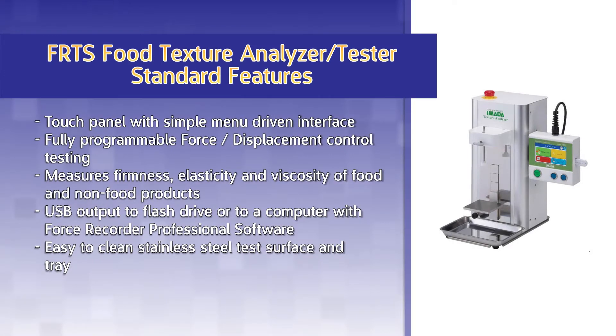The FRTS features a touch panel with a simple menu-driven interface. The tester features fully programmable force and displacement control testing. Measure firmness, elasticity, viscosity, and other textural characteristics of food and non-food products. Record data directly to a USB flash drive or to a computer with Force Recorder Professional software. The easy-to-clean stainless steel test surface and tray allow for quick and easy cleanup.